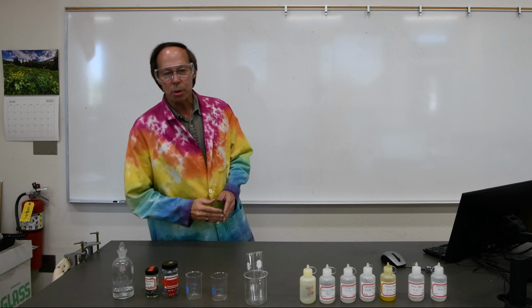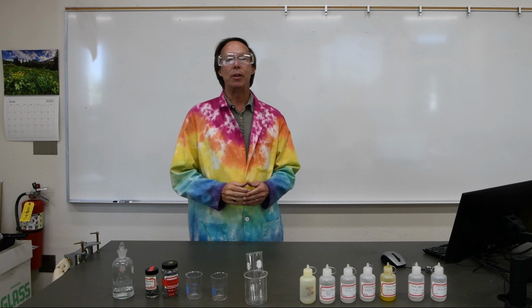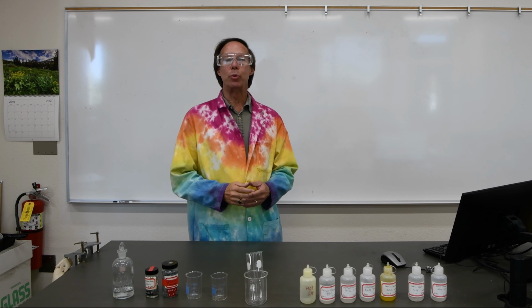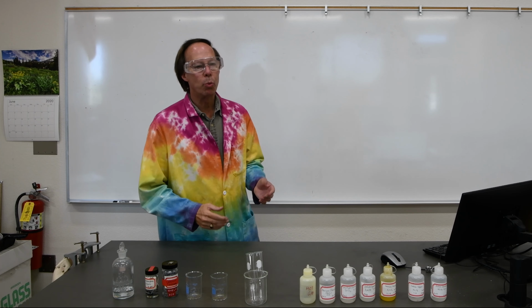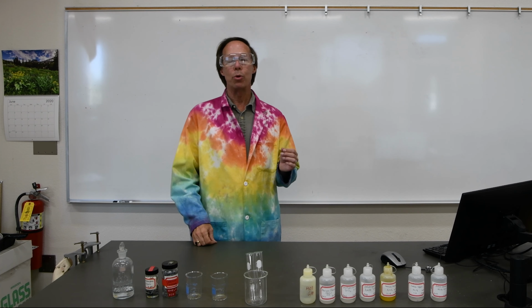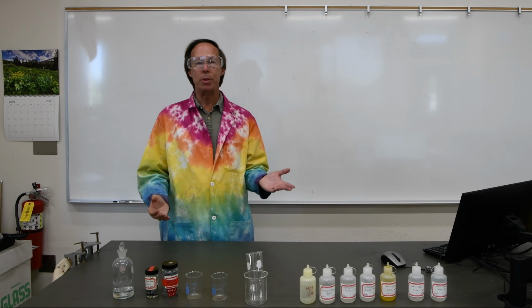We've been discussing the periodic table and trends in the various groups of elements. So today we're going to be taking a look at elements in group 2 and trying to determine what the trend is in reactivity as we go either up or down the group. Different groups on the periodic table will exhibit different trends.